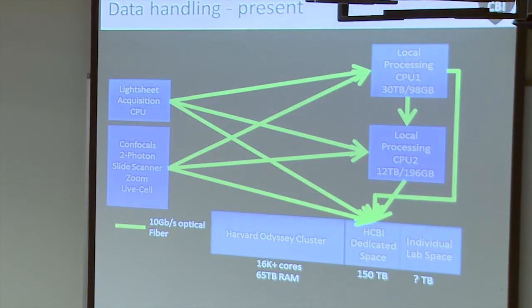So the things that I find are the most important is to figure out where your data flow is going to be, which computers it's going to move through, and make sure you have the fastest possible connection between those computers. Okay? If it's only 2 or 3 computers, it's not a huge expense to make that happen.